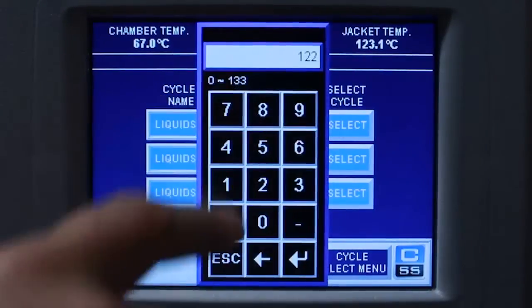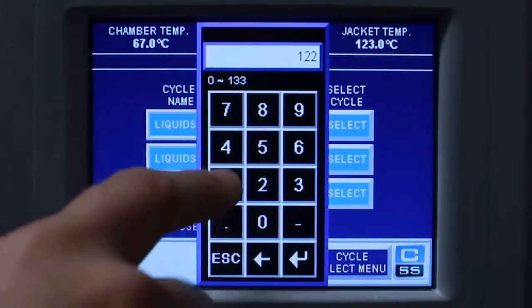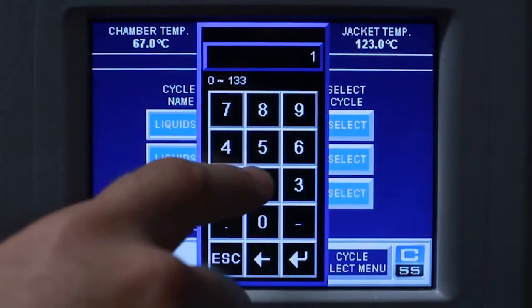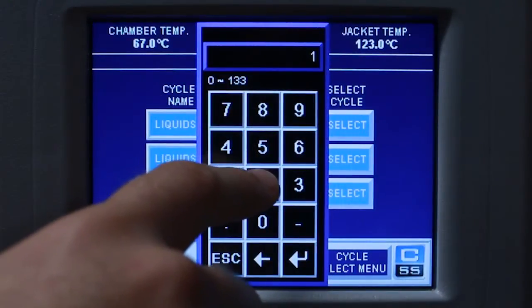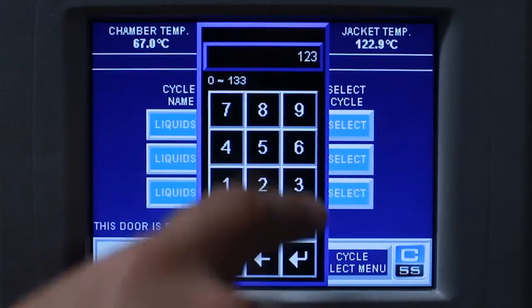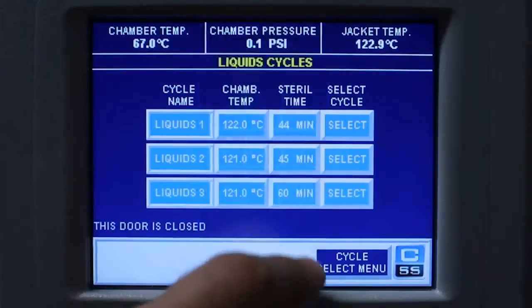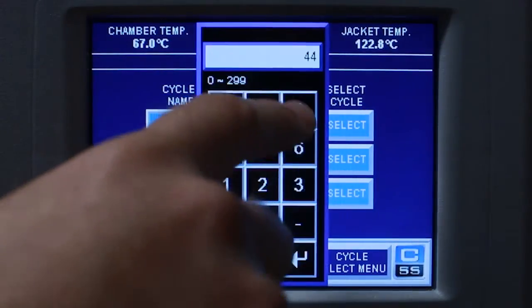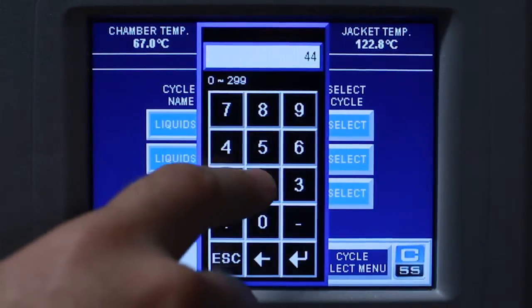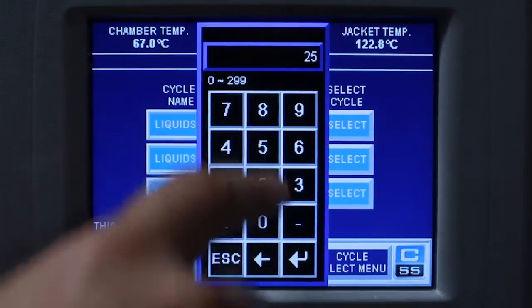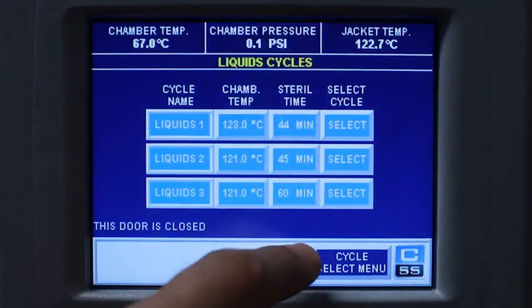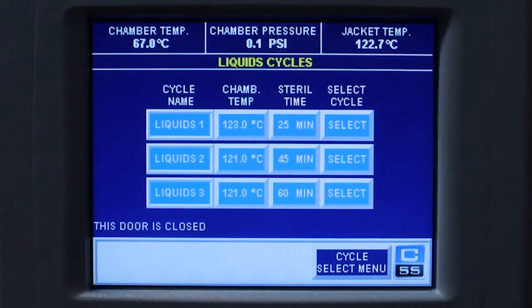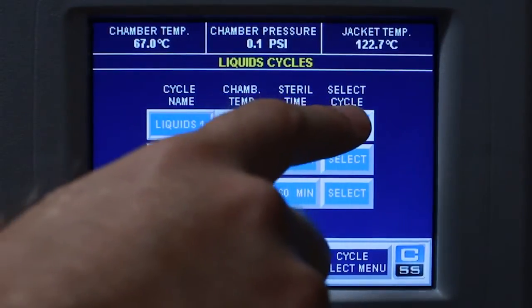Enter your chamber temperature parameter. Enter your sterilization time. Press select.